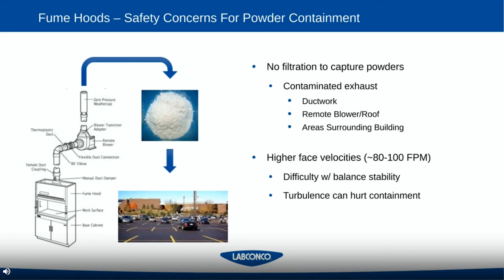Another critical issue with fume hoods is that they typically run at higher face velocities. While fume hoods have become more effective at lower face velocities over the years, EH&S organizations often choose to run them at 80 to 100 feet per minute or even faster, which poses inherent risks to both the process and user safety. The two most common disruptions are balance stability — especially when working with an open top-loader balance — and turbulent air causing non-uniform airflow through the face of the cabinet, which can bring powders out of the hood when airflow is too fast.